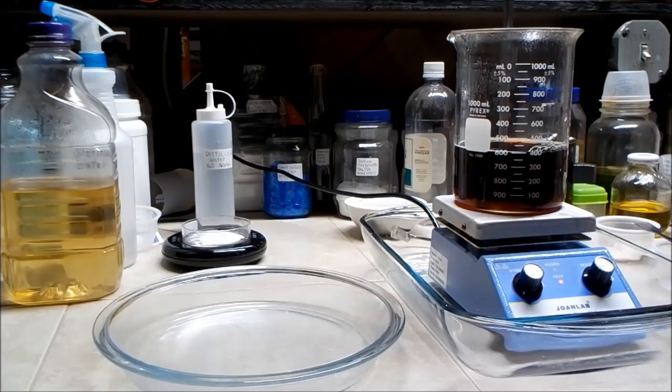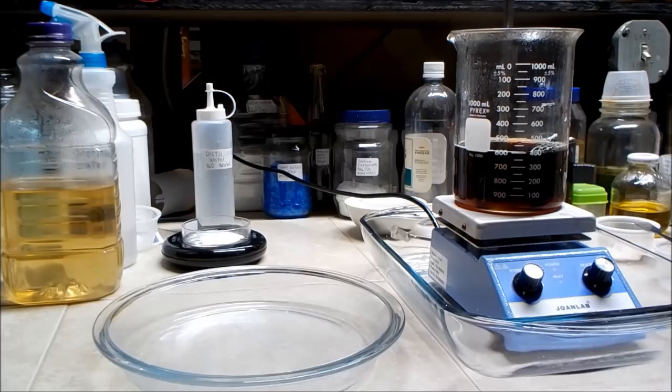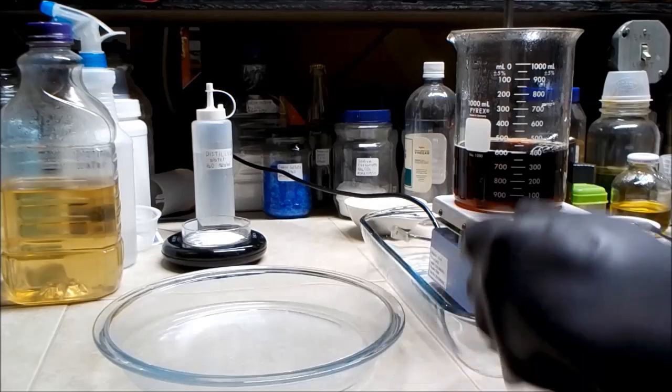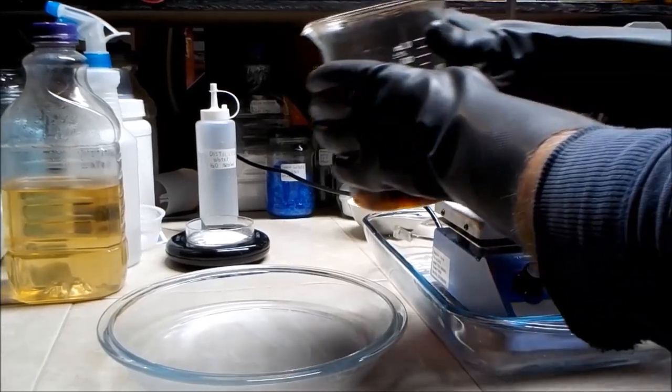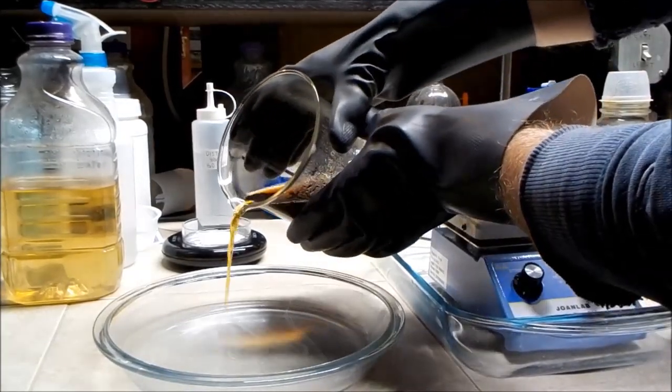The volume is now reduced down to about 400 milliliters. I'm going to turn off the hot plate and finish drying this down to a powder using a glass pie plate in the electric skillet.